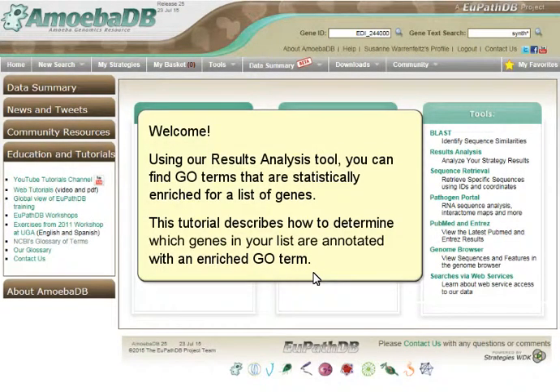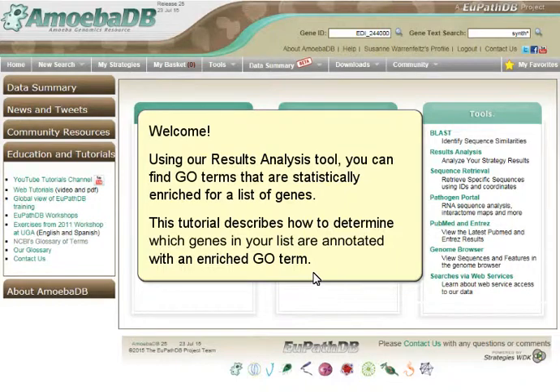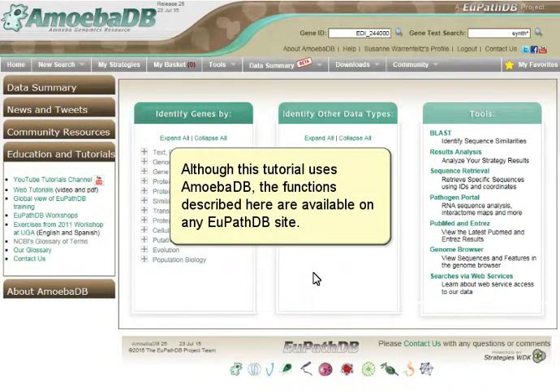Welcome! Using our results analysis tool, you can find GO terms that are statistically enriched for a list of genes. This tutorial describes how to determine which genes in your list are annotated with an enriched GO term. Although this tutorial uses AmoebaDB, the functions described here are available on any VEuPathDB site.